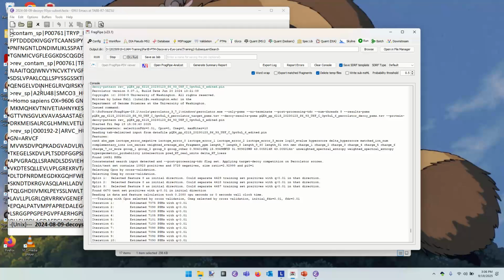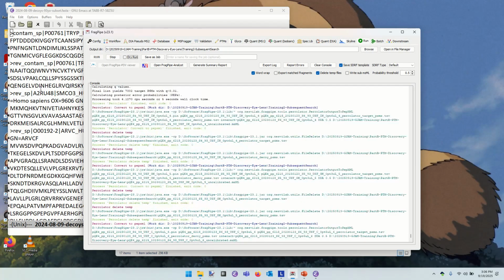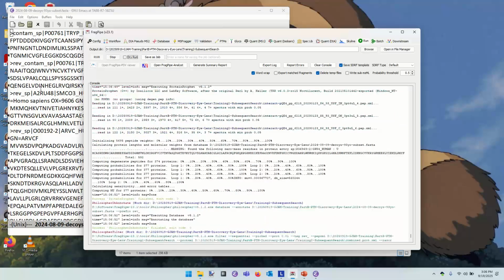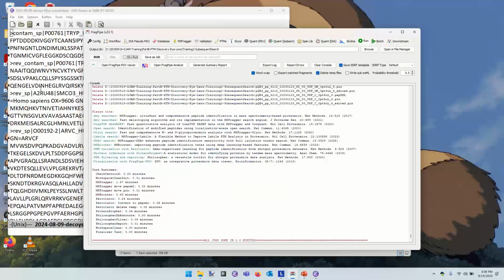So how do you interpret something like estimated 7,103 PSMs after a given number of iterations? Is that a good number? Is that a bad number? What's a denominator we can use to compare that to?